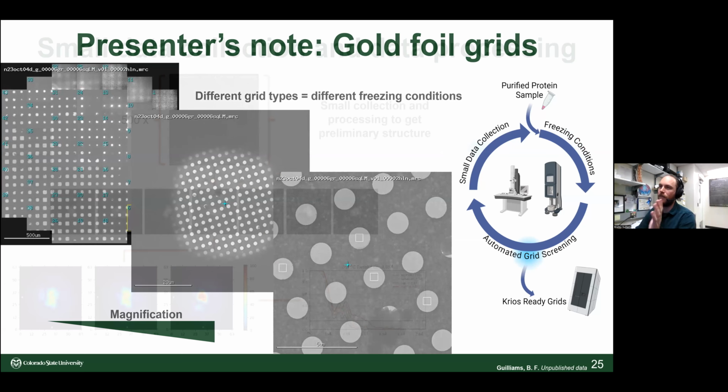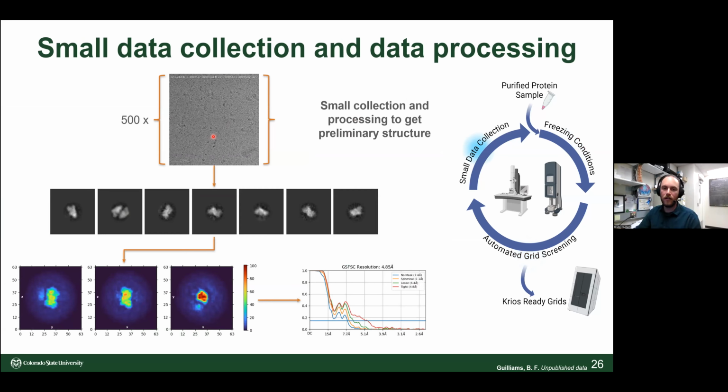Okay, so towards the end of the week here, I had several grids that were okay, and we wanted to do a small data collection. If you're new like I was, it's hands-on time practicing using something like CryoSPARC, which is what I've used for all of my data processing so far.